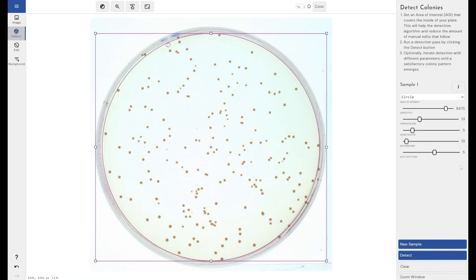Users do have the option of changing the sensitivity or the parameters of the colony detection algorithm. I'm not going to delve into that now. I'm just going to use the defaults and see how well we get on.